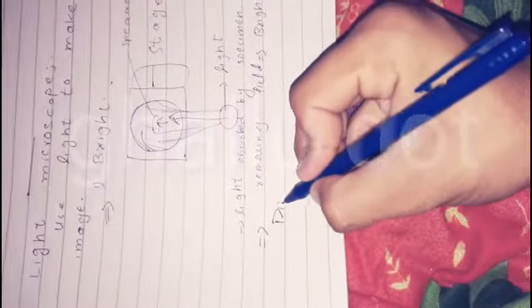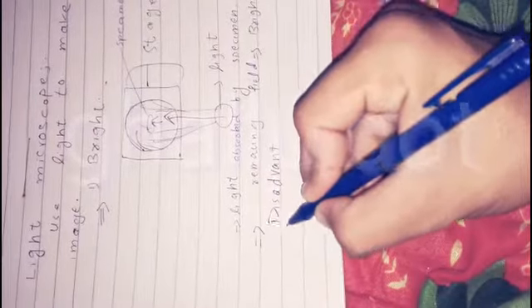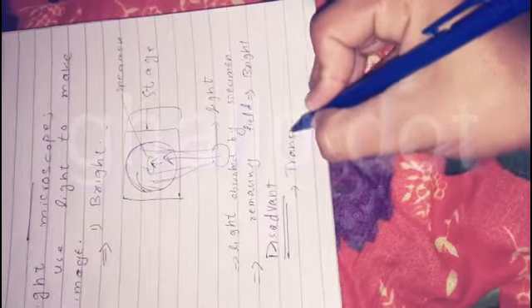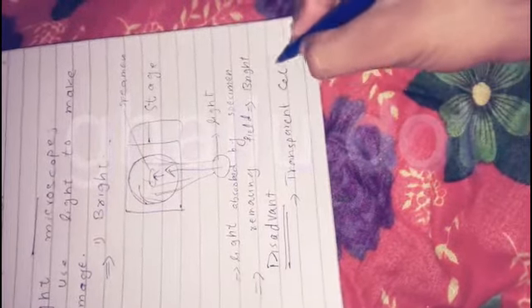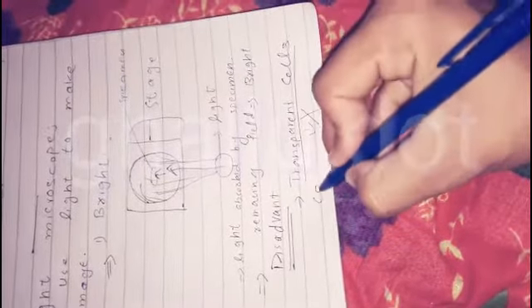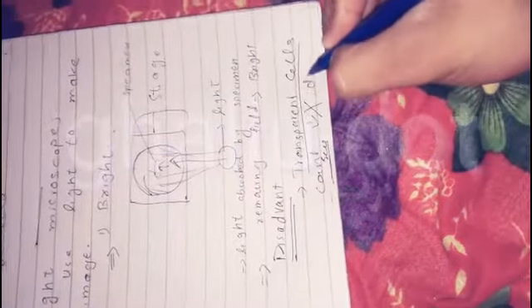The remaining field will be bright, because light is going on the whole stage. Its disadvantage is that a transparent cell can't be seen.